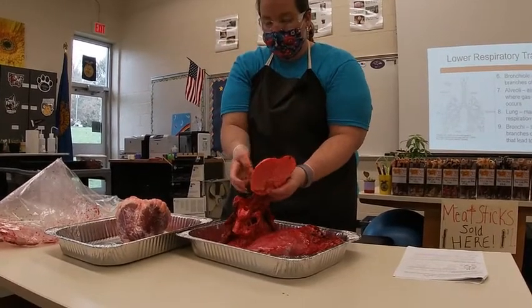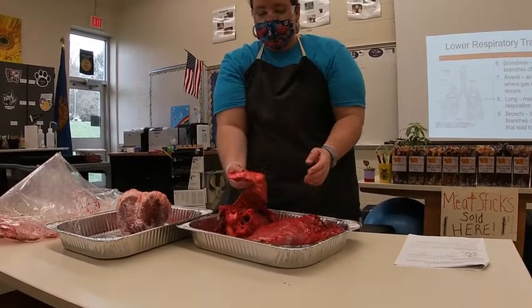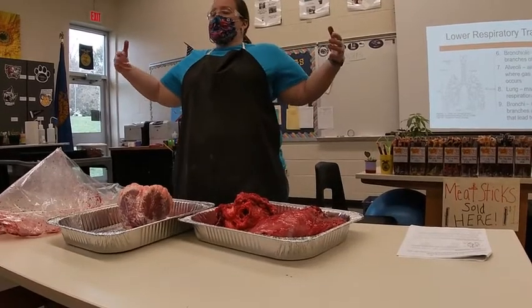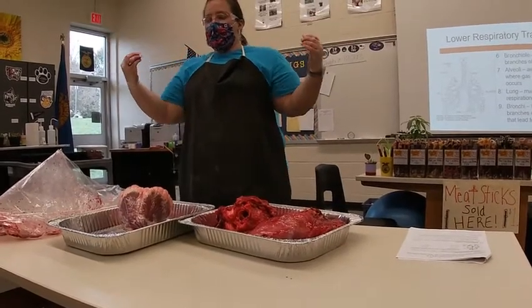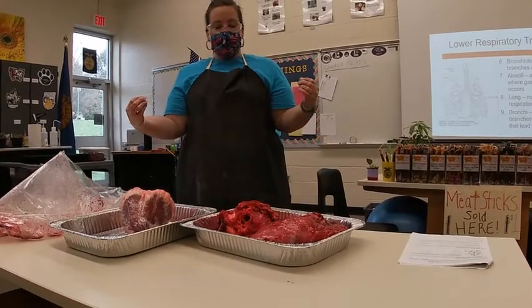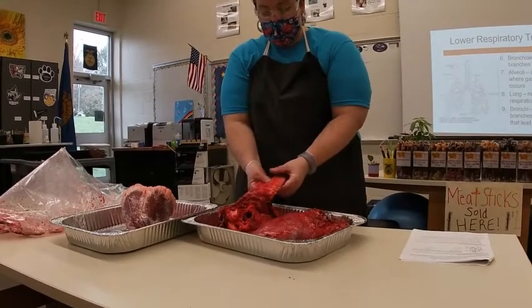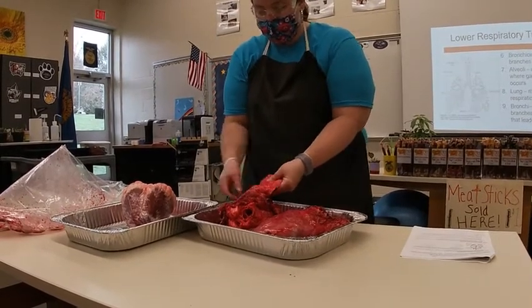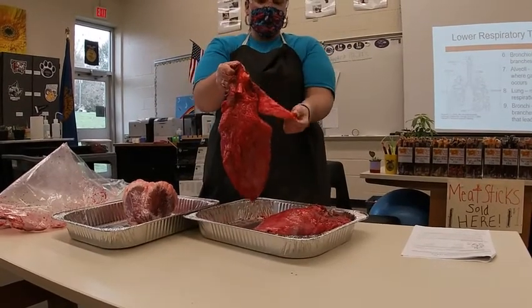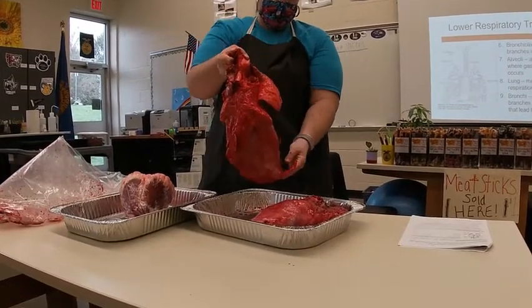I'm going to let it deflate. Every time an animal breathes, it inflates the whole thing and the lungs expand, and then as they exhale, the lungs do the opposite — deflate. You can see there's still some air in here, so it's still a little inflated and it'll take some time to go back to the resting state.